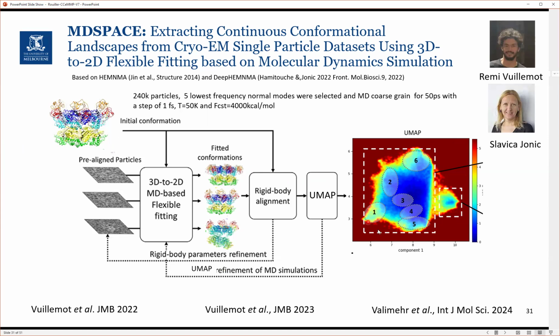As it becomes too difficult to see with 200,000 particles, or 200,000 models, we color by a heat map. Blue indicates a region of the map where we have a lot more models, and red fewer models.